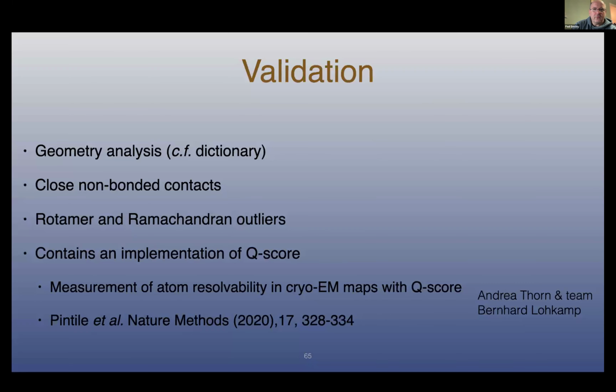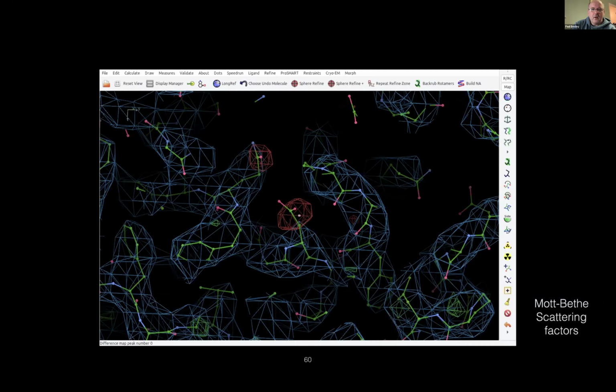Servalcat. Oops, where has that slide gone? Oh, I've missed a slide somehow. So now there is a non-blocking interaction with Servalcat. Non-blocking means that the user interface doesn't stop while the refinement is running. What that means is it can take the current model and compare it against the reconstruction and give you a difference map kind of live. It's not within a fraction of a second as it would be for crystallography, but it's within 20 seconds, which is better than nothing, or better than it used to be without this useful feature.